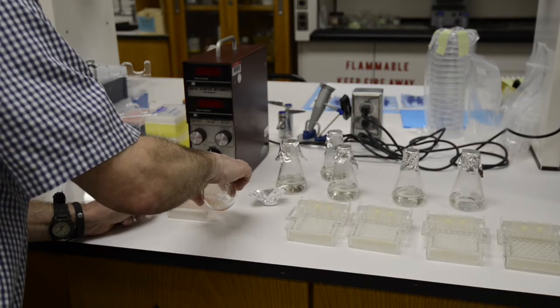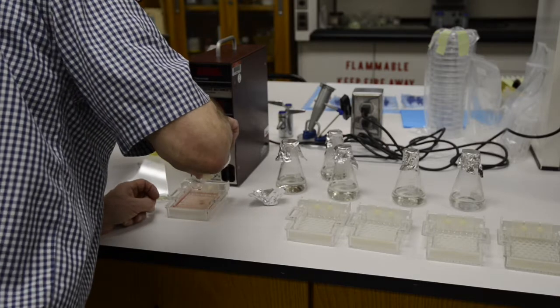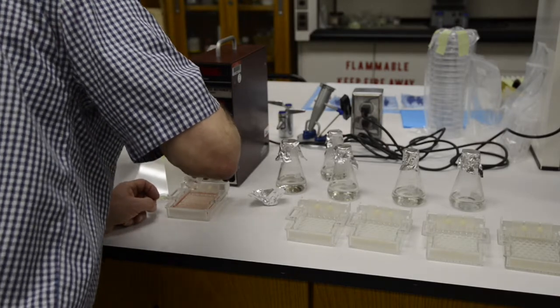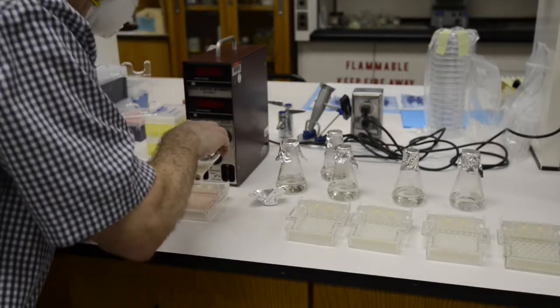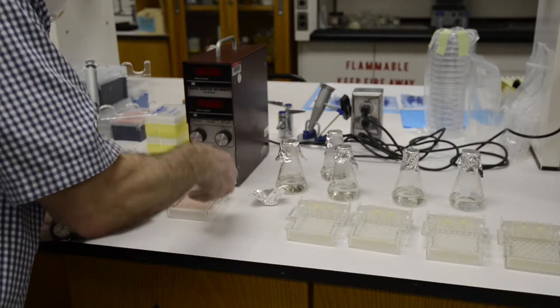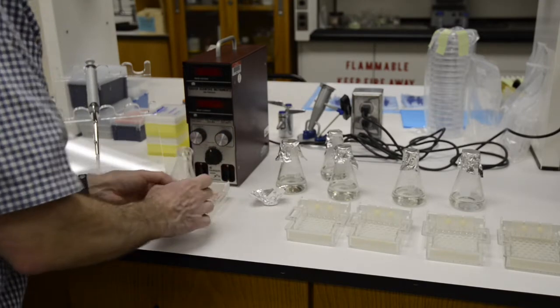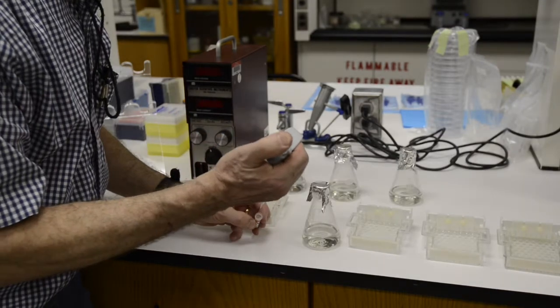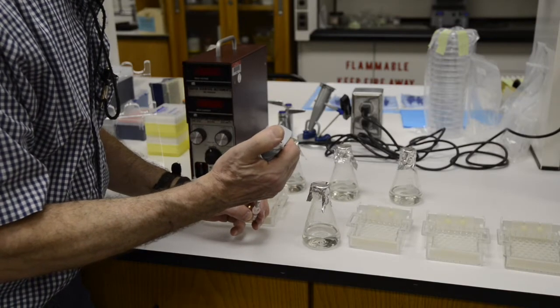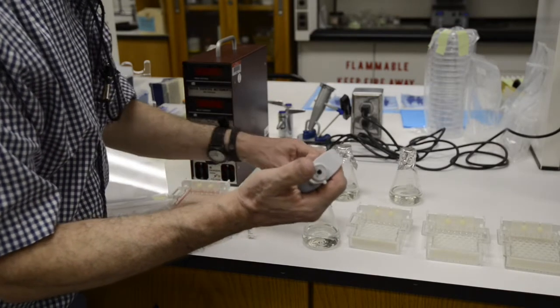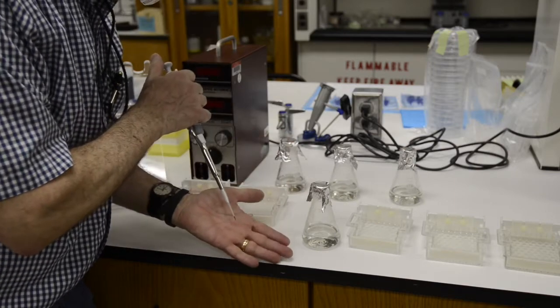Pouring your gel should be done with the comb already in place. If there are any bubbles that form, use a pipette tip to move the bubble off to the side. And then don't touch the casting tray. Let it solidify. It'll take 5 or 10 minutes for it to solidify, and then you'll be ready to load your gel.